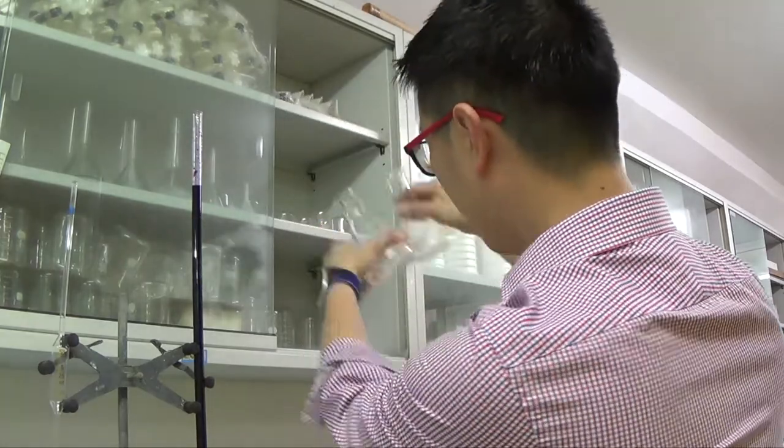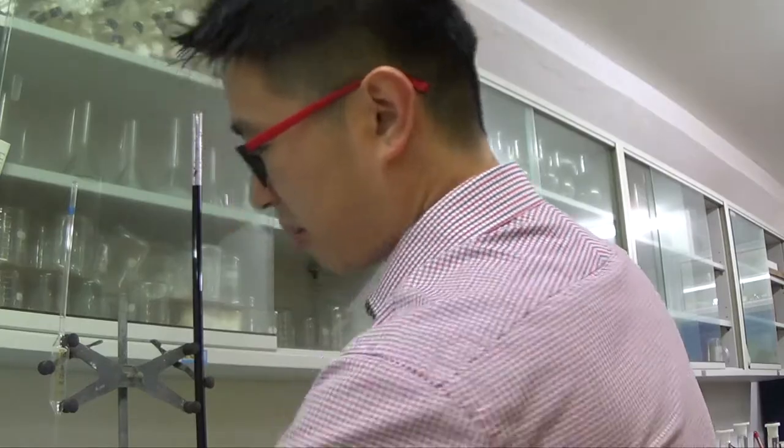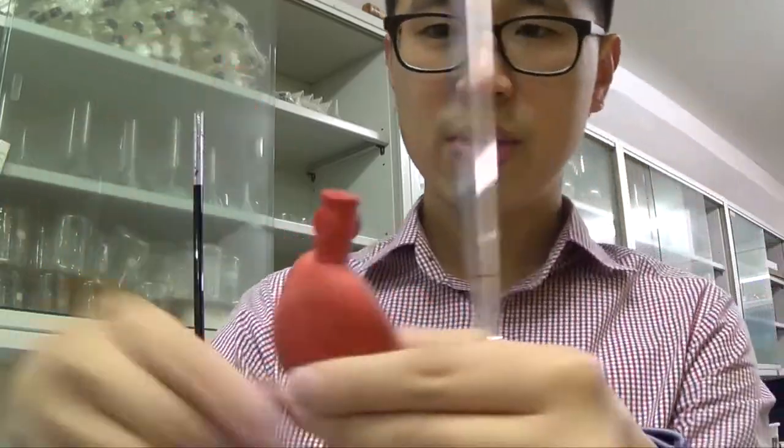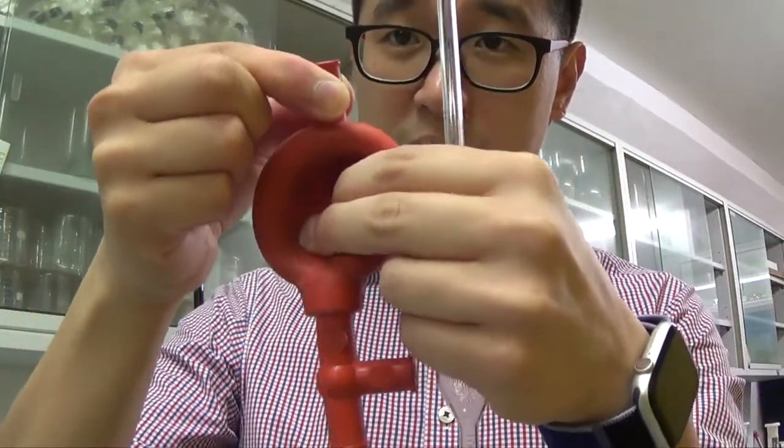I have a little bit of water in there, but like I said, it will not affect the end point because I'm going to pipette out the right amount of the iron 2. So this is the pipette, this is the pipette filler. I press A, and this is compressed. Okay, so put the thing gently into the hole, and be careful about poking it in by force, because this is sharp glass.